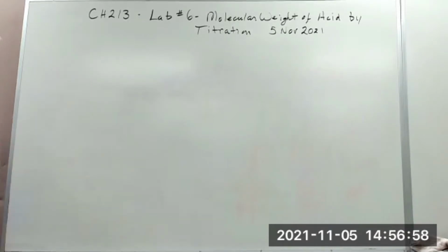I like to keep things real simple. The basic premise, the target of this procedure, is to determine the molecular weight or the molar mass of an acid. What do you need to know to do the molecular weight?